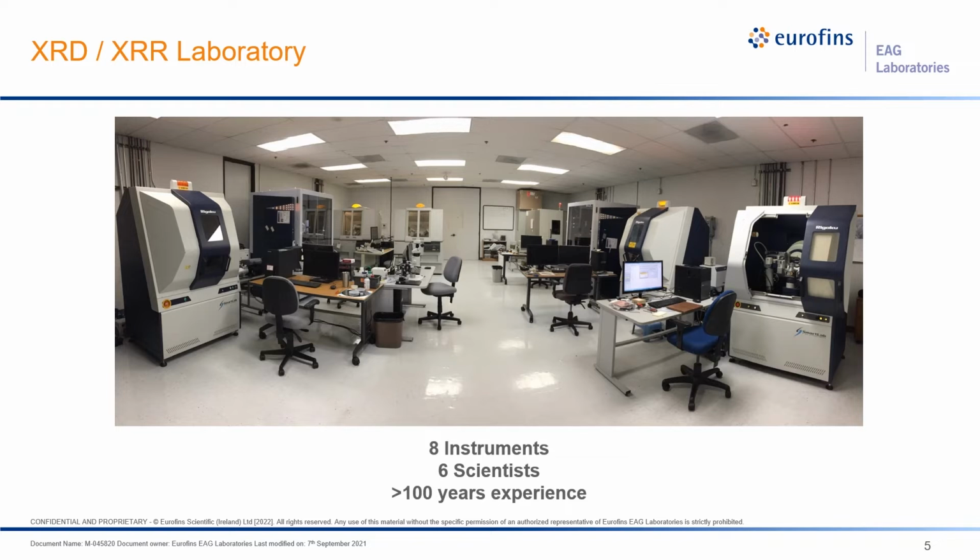And finally, I'll point out our newest instrument on the left. This is one we just recently acquired and is optimized to run pharmaceutical samples or medical devices. It's got a low temperature stage that can reach down to -180 C, all under vacuum or a variety of atmospheres, as well as controlled humidity. Hopefully this brief tour gives you an idea of the immense capabilities we have available to us.